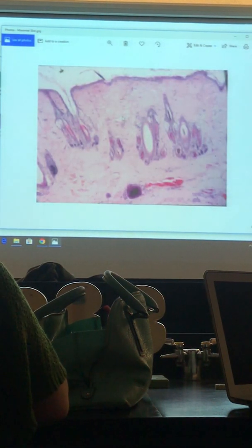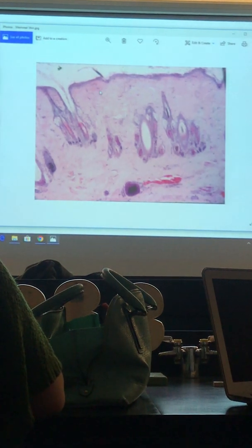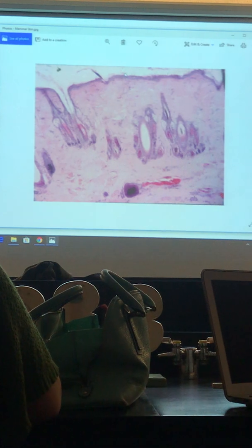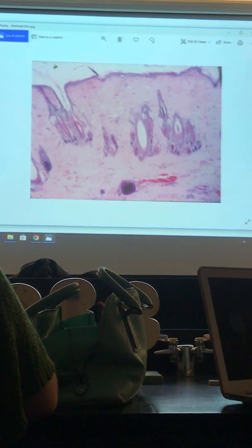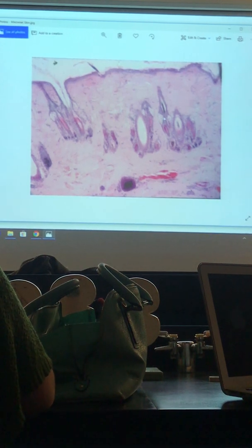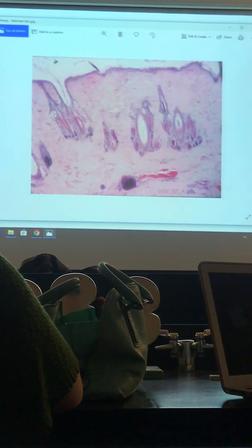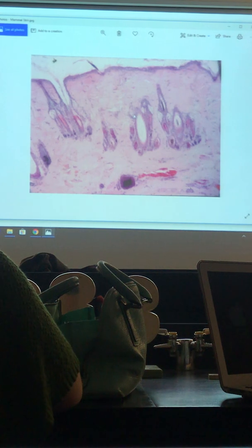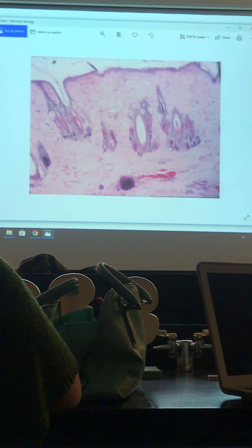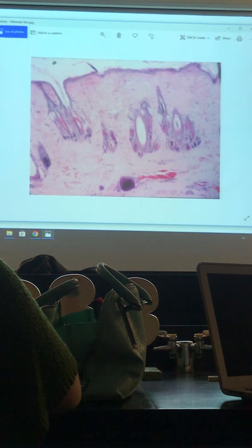Thin skin again. So here this happens to be, I think, a rat. So there's the little bit of stratum corneum. This is epidermis. All of this is dermis, and it looks like hypodermis. But the key is, these are really good sebaceous glands. See? Those are sebaceous glands. The hair coming out at you looks like a circle. Going up straight looks linear.